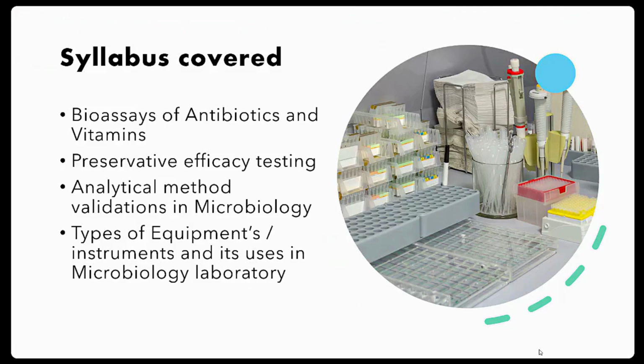Next, types of equipments, instruments, and their uses in the microbiology laboratory. We'll use different types of instruments and equipments in the lab, like autoclaves, incubators, biosafety cabinets, laminar airflows, air samplers, microscopes, etc. Each and every instrument's uses and its principle we'll discuss in this section.